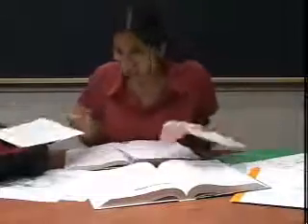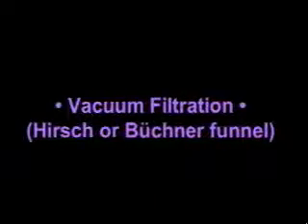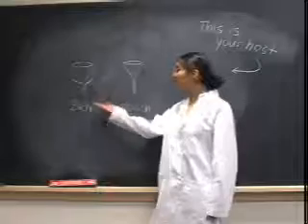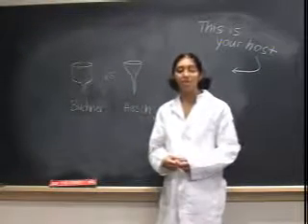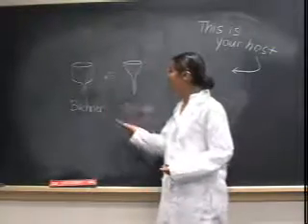But what if you have 3 pieces, a test tomorrow, a paper due the next day, and your mixture just doesn't seem to understand you're pressed for time? Well, then you have the option of vacuum filtration. For vacuum filtration, you can use either the Buchner or the Hirsch funnel, depending on what you're filtering and how much there is to filter. Really, there's not much of a difference between the two, besides shape and size.